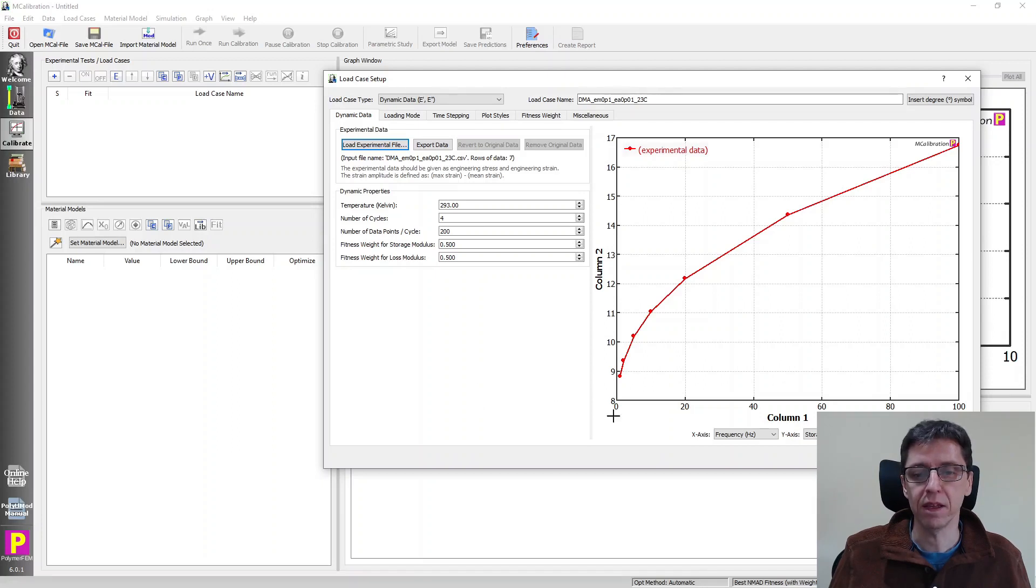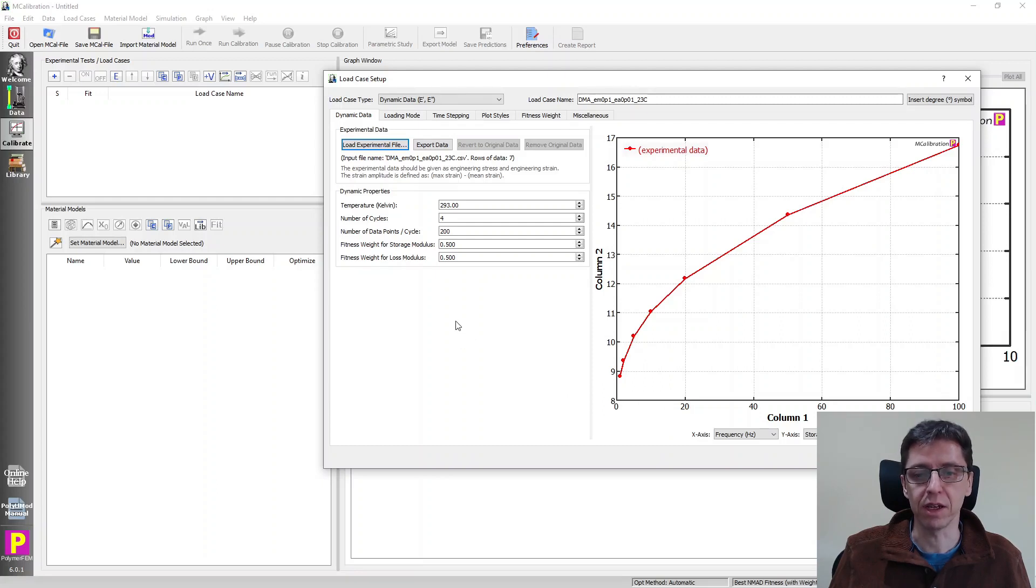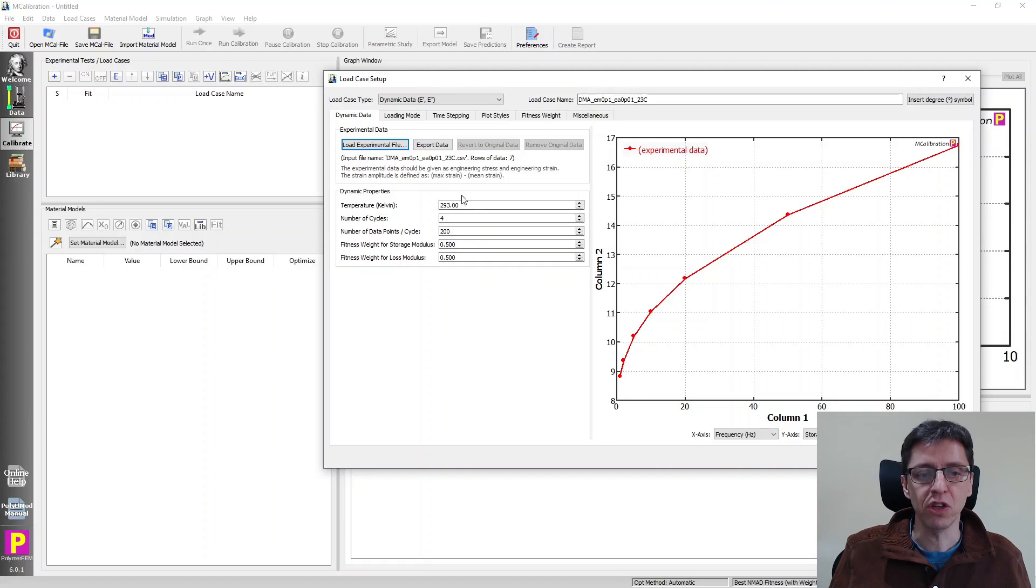And here's just a plot of the, in this case, frequency versus storage modulus. We can plot it later in the main window. But there are some other features here that are worth talking about.